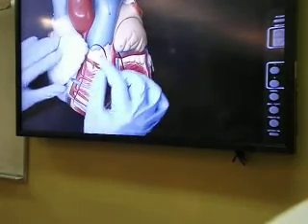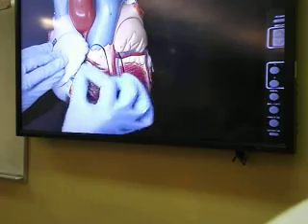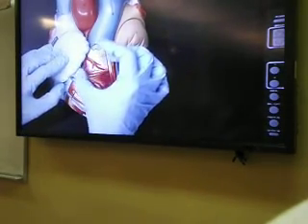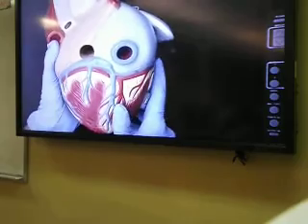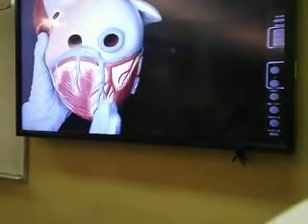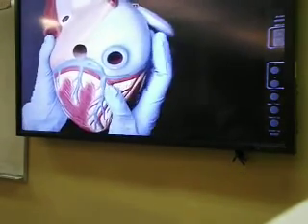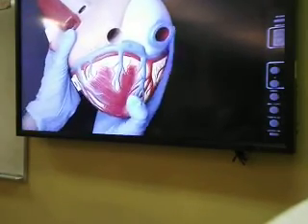Now, if I look between the right atrium and right ventricle, there is a very deep groove, and there is an artery there which we call the right coronary artery. It actually becomes the posterior interventricular artery on the posterior aspect, and it goes right where the posterior interventricular sulcus is, and that posterior interventricular artery will supply the oxygen to the posterior myocardium.